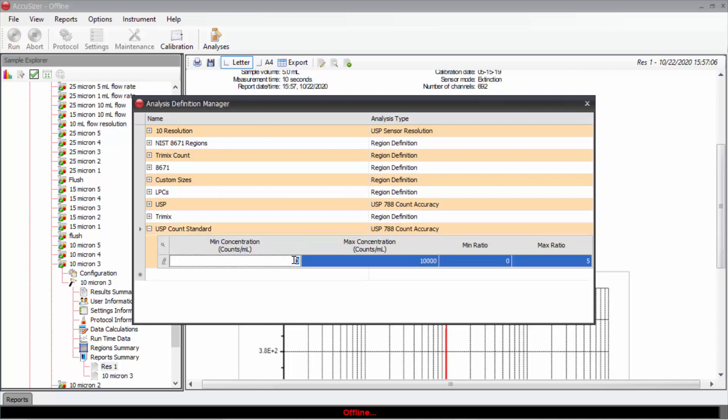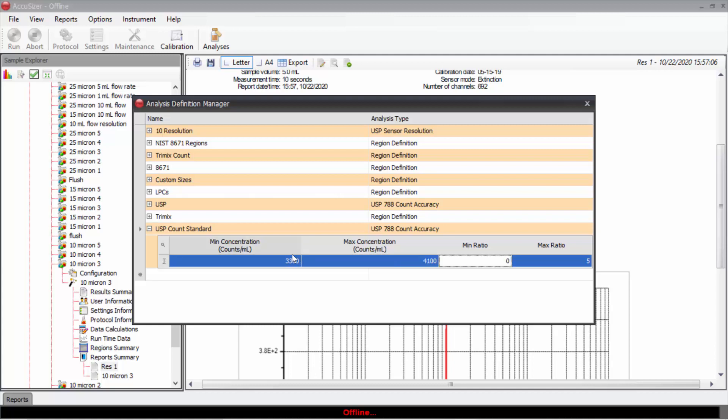What I need to enter is the minimum concentration, which for this bottle was 3,300 per ml. The maximum concentration was 4,100 per ml. The minimum ratio was 1.78 and the maximum ratio was 2.57.